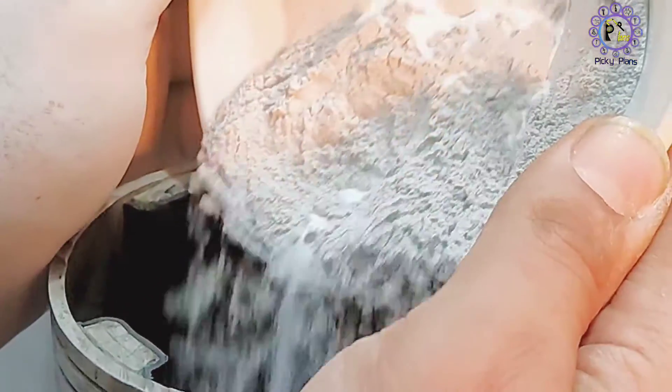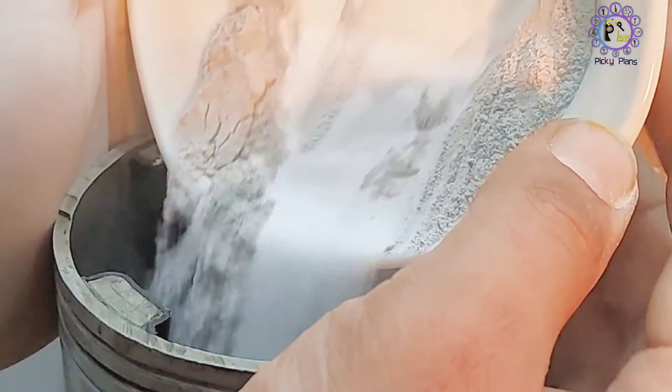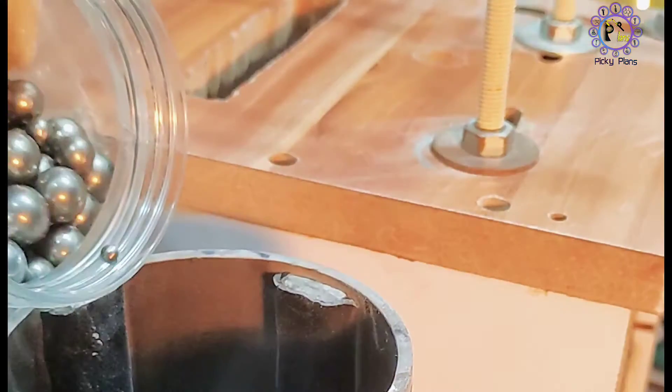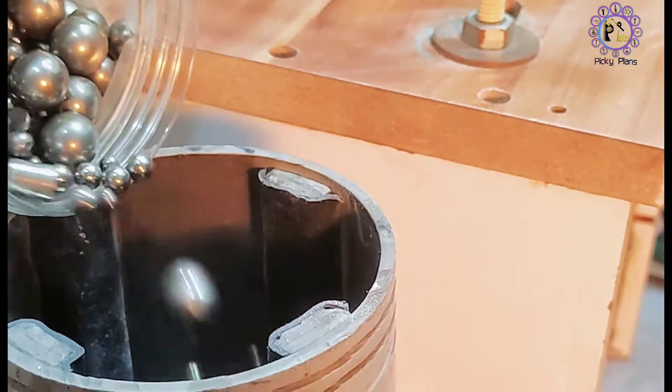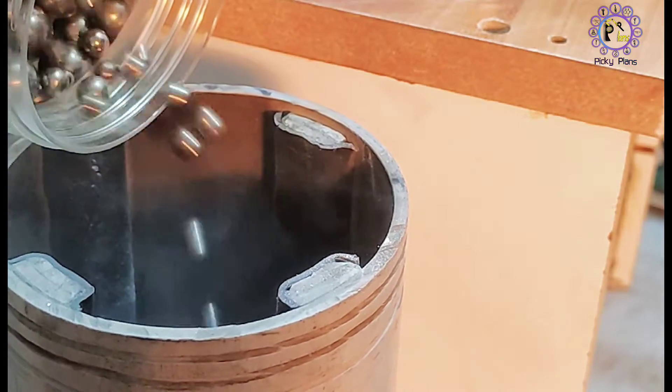Afterward, I add the powder to the ball mill to mix them thoroughly and crush any possible coarse particles. Then I add steel balls to the ball mill tank to fill about one third of the capacity of the tank.